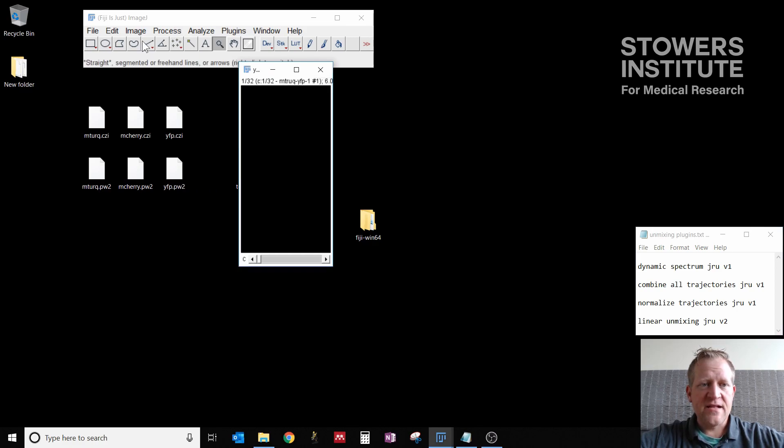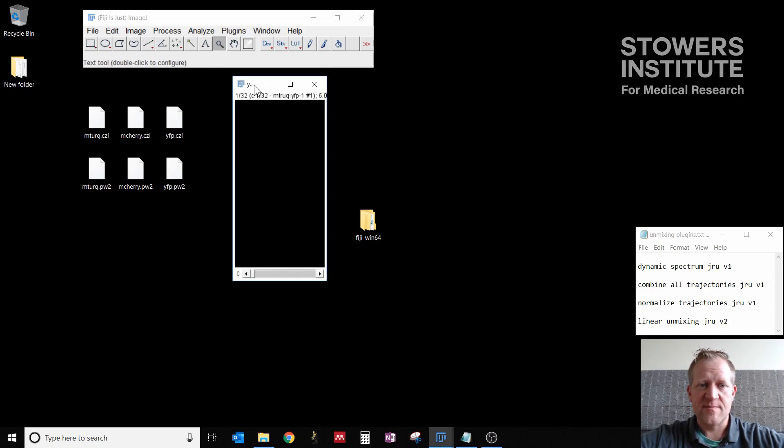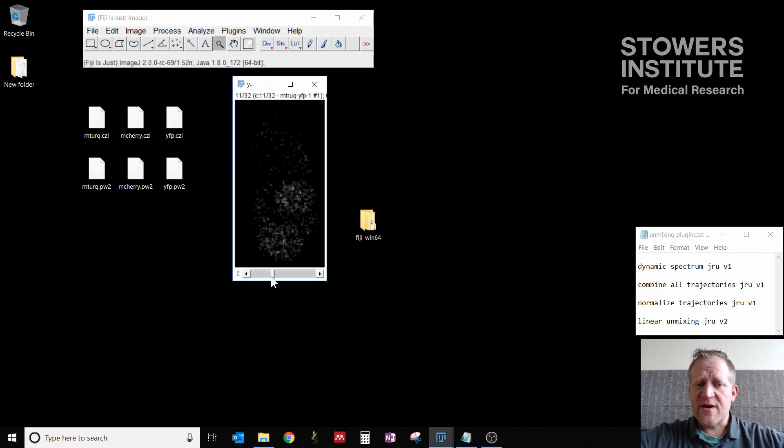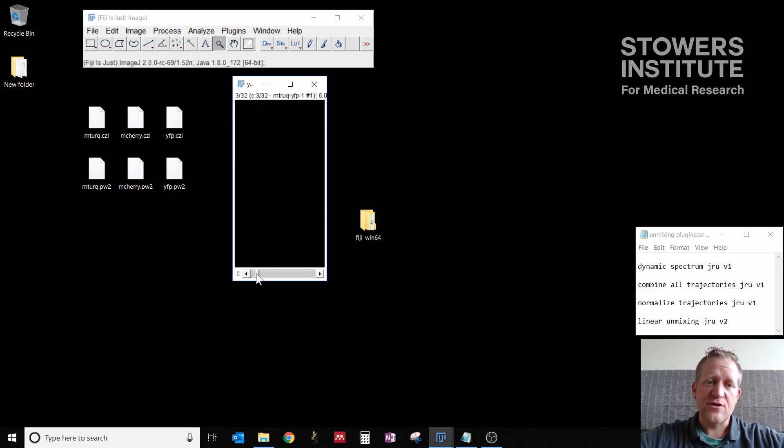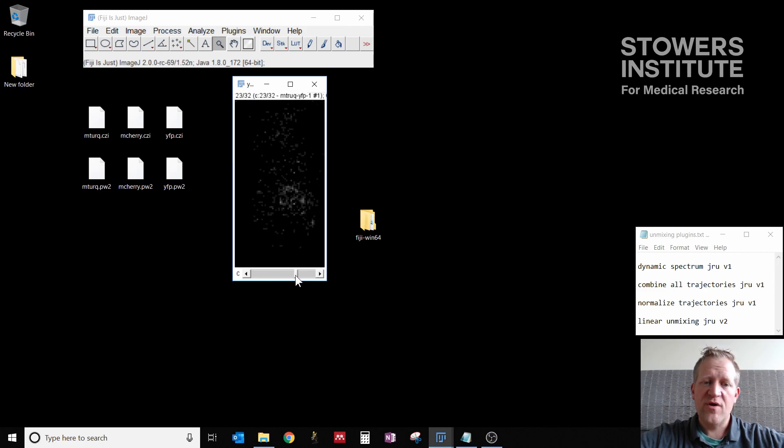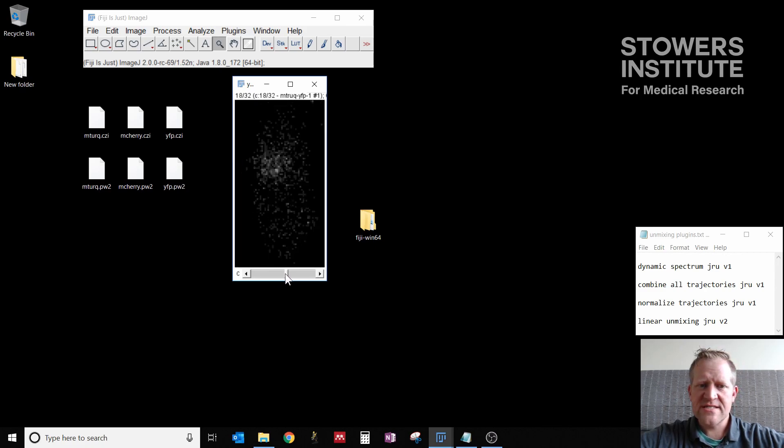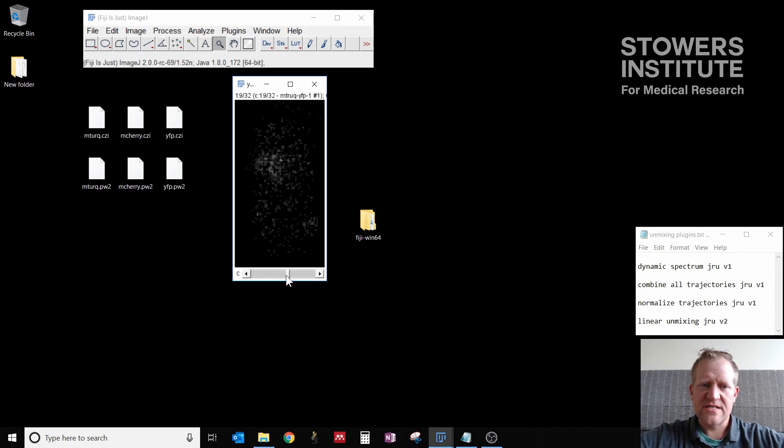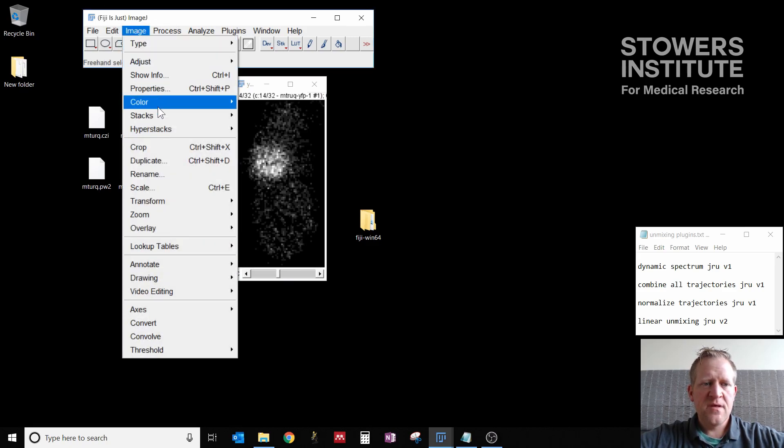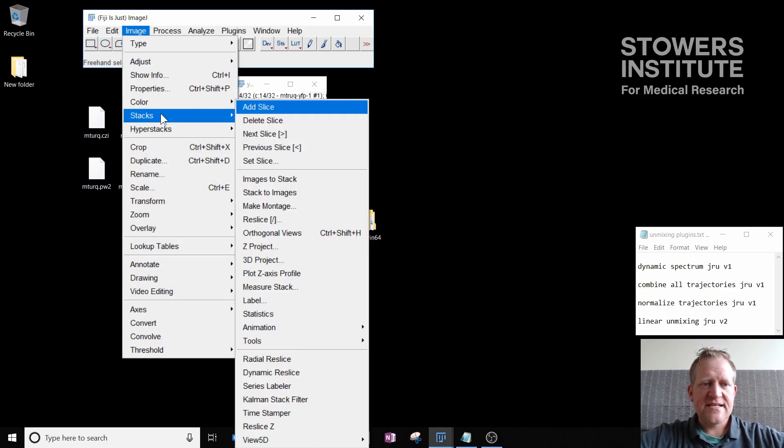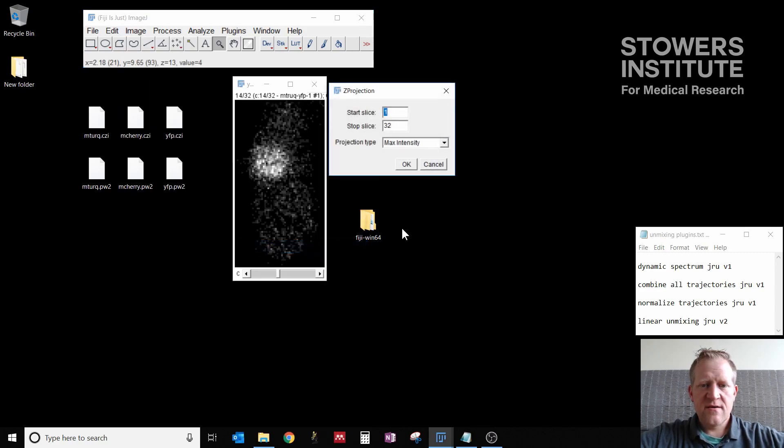So that we can see what's going on, I'm going to run a Z projection. We're going to do a max intensity projection so that we can see what's actually in this image. I'm making no assumptions about your hardware, but our hardware has a 32 channel output for spectral data. Since it's a little bit difficult to see what's going on here, I'm going to go to image stacks Z project and do max intensity.